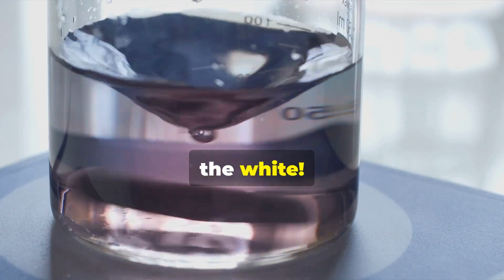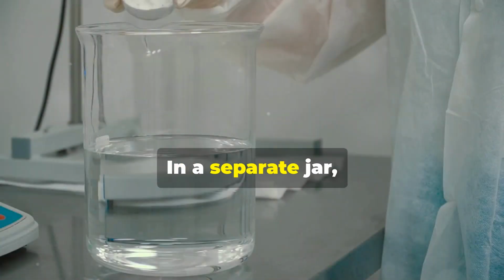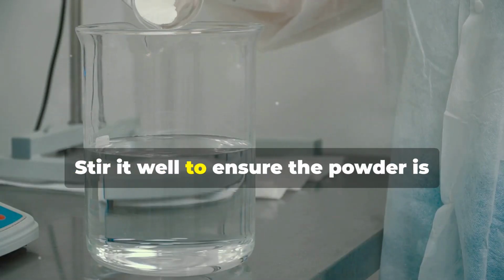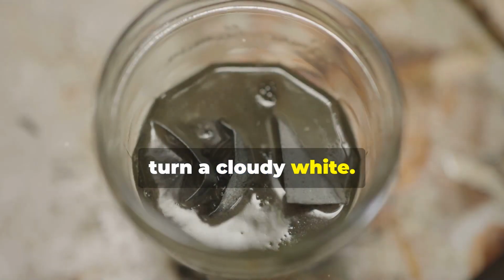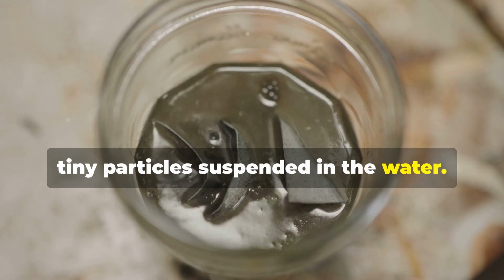Next up, the white. White symbolizes purity and innocence. In a separate jar, mix a spoonful of sodium carbonate with water. Stir it well to ensure the powder is fully dissolved. This solution represents purity and will turn a cloudy white. The cloudiness is due to the formation of tiny particles suspended in the water.